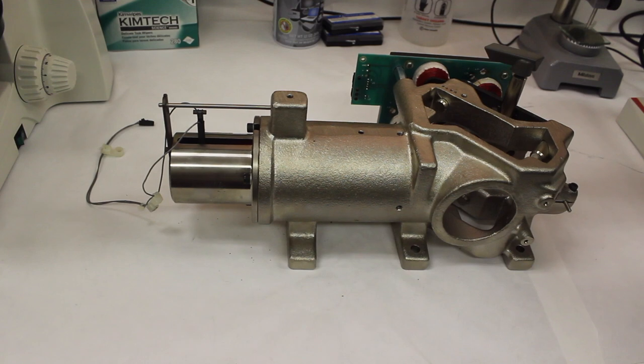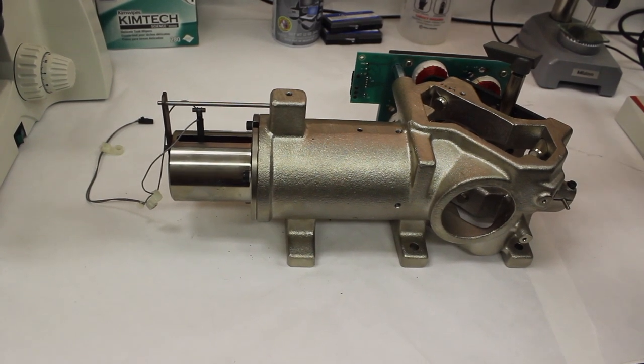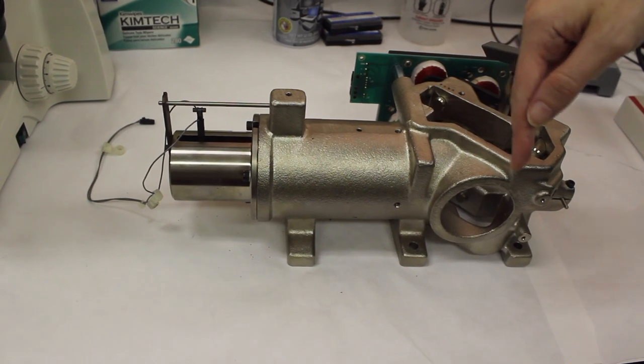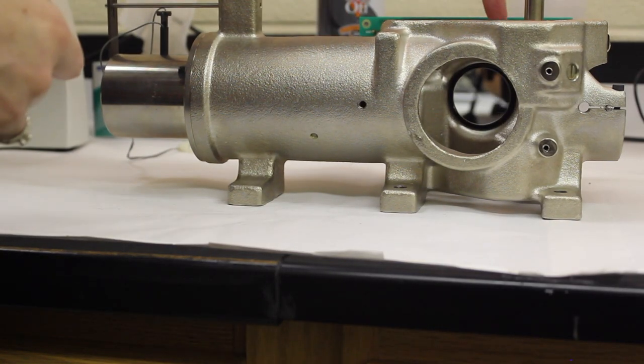So this is the interferometer, which is the main part of the IR spectrometer, and it has this hole or area where the infrared light comes into the interferometer.